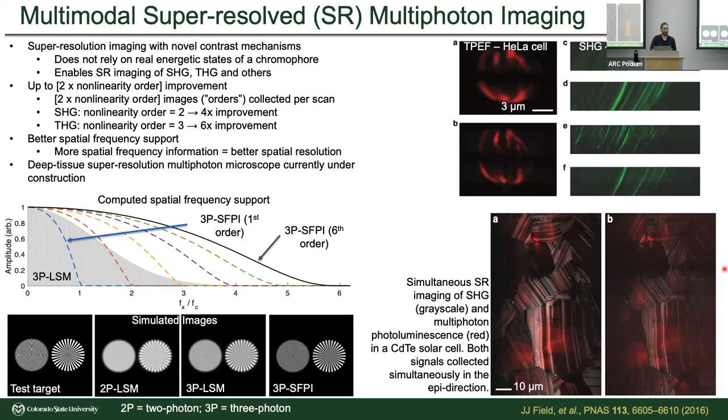And I can give you an example where we've looked at collagen, for example, and digested that over time with collagenase. So you'll see that second harmonic generation there, that structure starts to dissolve. You start to lose that orientation. And really, to say it in the language of multiphoton, what happens is it goes from being a non-centrosymmetric structure to being centrosymmetric. In other words, it looks roughly the same in all dimensions, right? Because it becomes sort of randomly oriented.